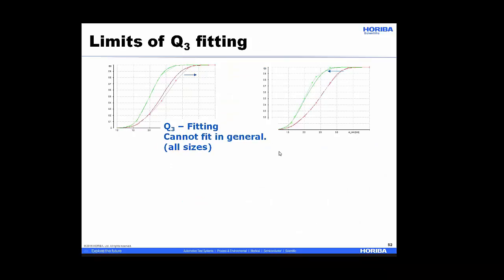Now there is a limit to this quick and dirty approach, which is shown by these two samples in green and red. So on the left side I have one fitting set, and the green fits quite nicely, and the red stars do not fit the smoother cam sizer results very well. But if I do a fitting so that the red stars fit, the green doesn't fit perfectly. Now in some processes this fit is quite close enough, but we can do better, so we will.